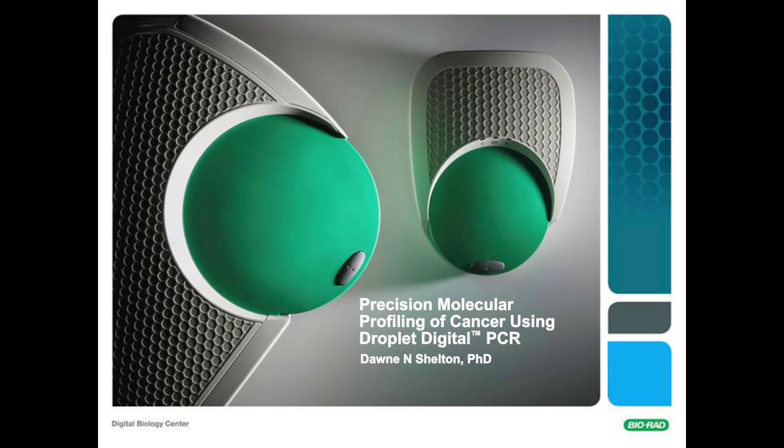Thanks, Mohini. Hello, my name is Dawne Shelton, and I'm a Senior Applications Scientist at the Digital Biology Center in Pleasanton, California. I was hired to help translate the new Droplet Digital PCR technology into applications in the cancer field. I'm here today to talk to you about the molecular pathology and the liquid biopsy with ddPCR.